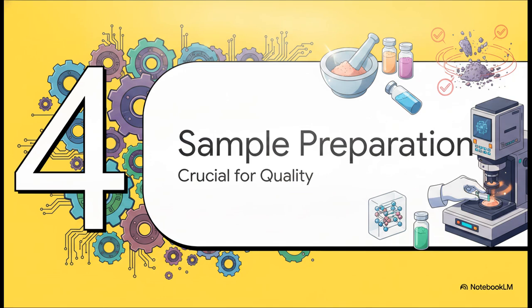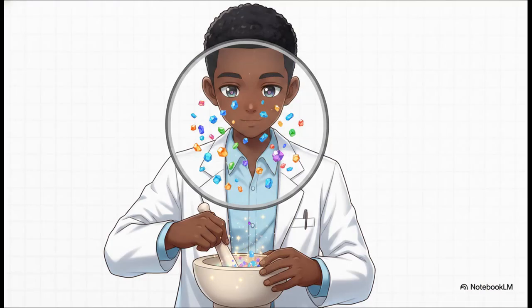But here is the catch, and this brings us to part 4, crucial sample preparation. All of this multi-million-dollar engineering is completely useless, literally a paperweight, if your sample prep is bad. This is universally acknowledged as the most critical and, honestly, the most error-prone step in the entire process. Remember, we are talking about powder X-ray diffraction here. If we were doing single crystal diffraction, we'd just mount one perfect, highly ordered crystal. But for powder diffraction, we desperately need what's called an isotropic sample.